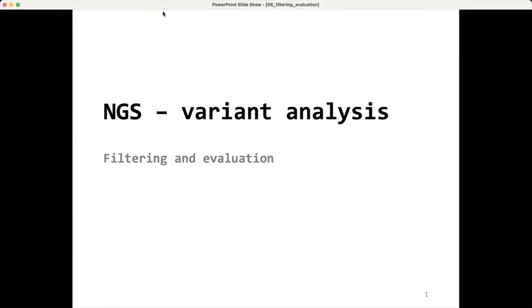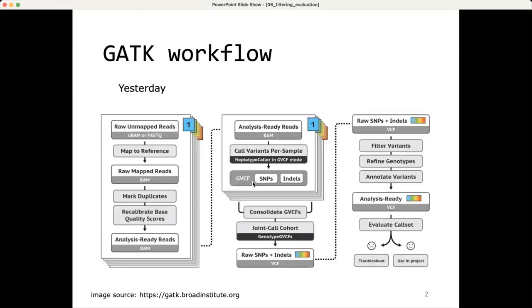So now that we have created our VCFs, we have created a genomics DB and out of that genomics DB we have extracted the VCF containing all of the variants in our trio, basically all variants in our cohort. Now it's time to separate the real variants, the real existing variants from the false positives. And that is not a very trivial task.